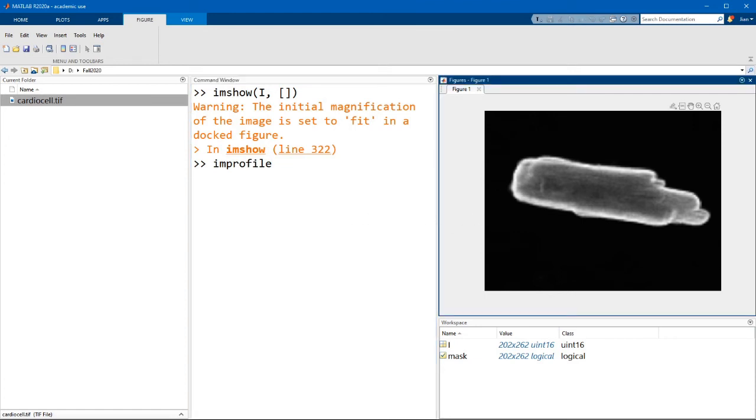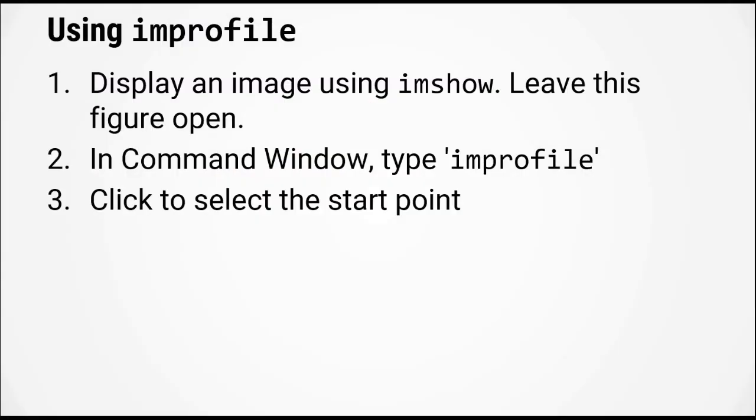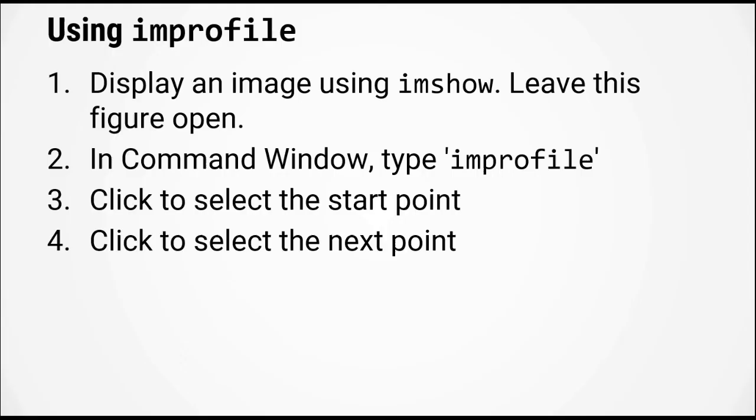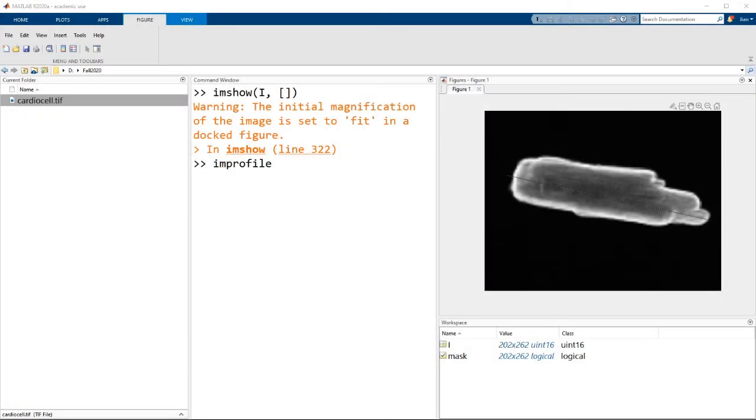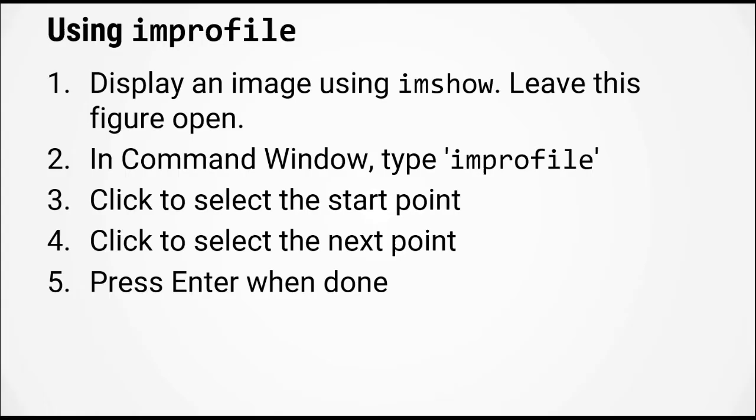Now when you hover over the figure window, you will see that the mouse cursor changes into a crosshair. In step three, click on the start point where you want to start the profile. Step four, click to select the next point. Finally, when you're done selecting the line over which you want to measure the intensity profile, press enter.